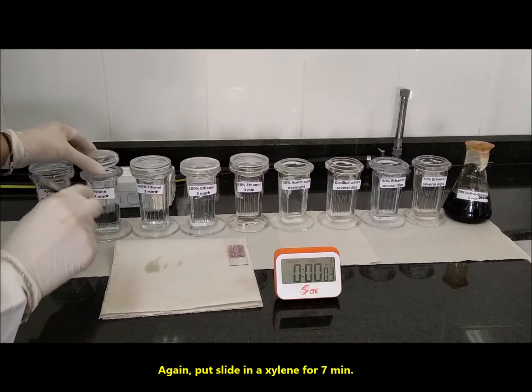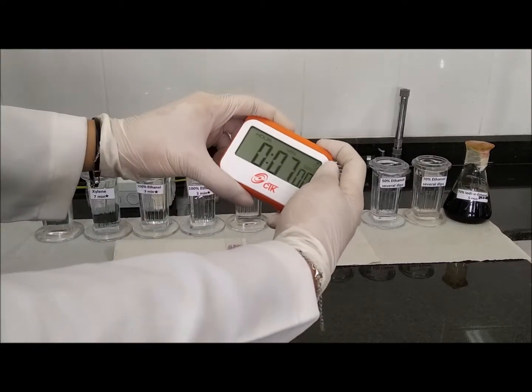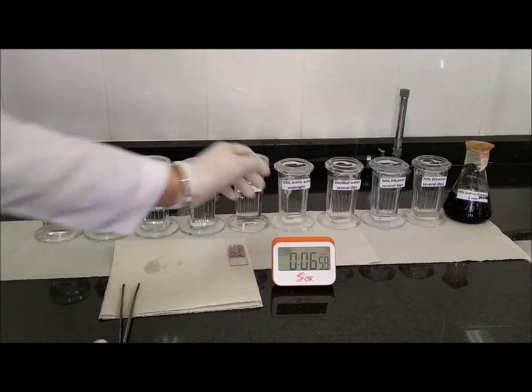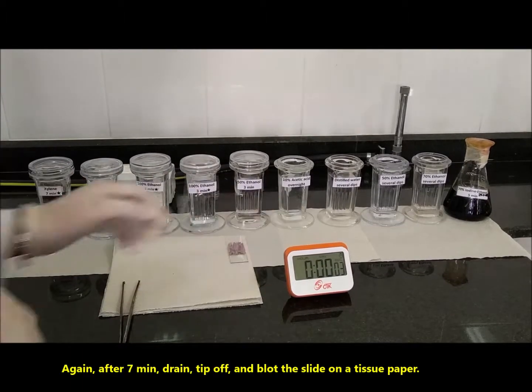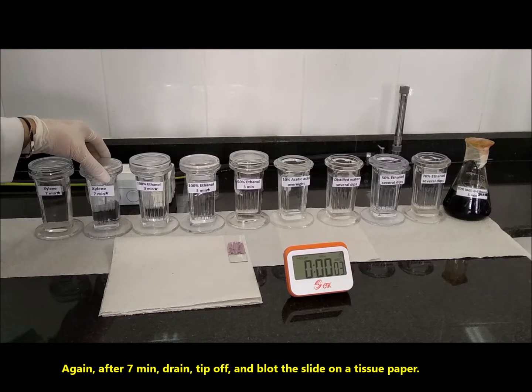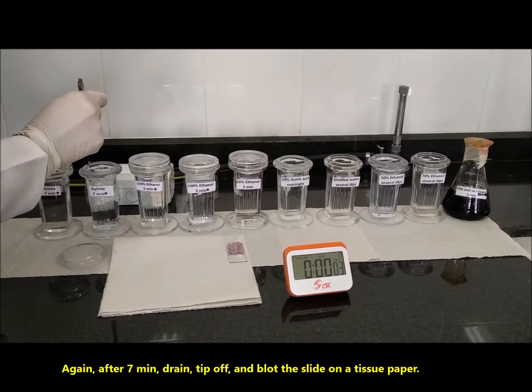Again, put the slide in xylene for 7 minutes. After 7 minutes, drain, tip off, and blot the slide on a tissue paper.